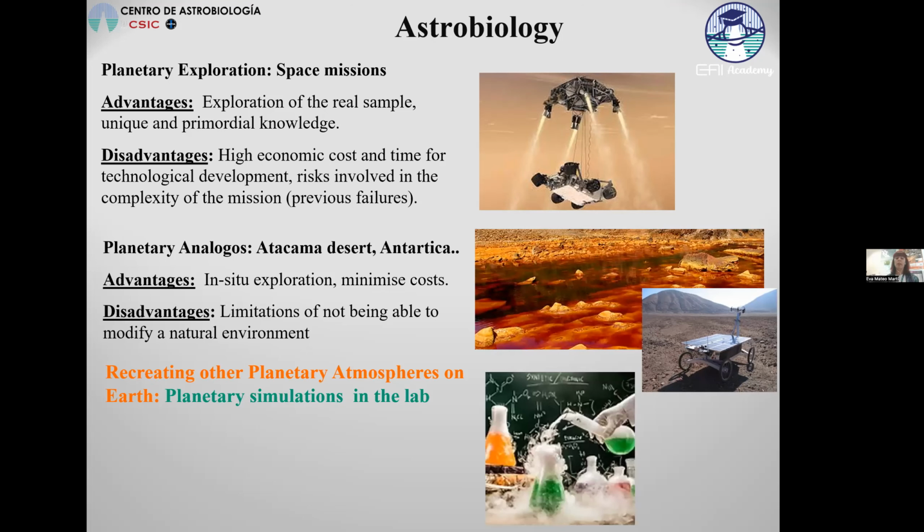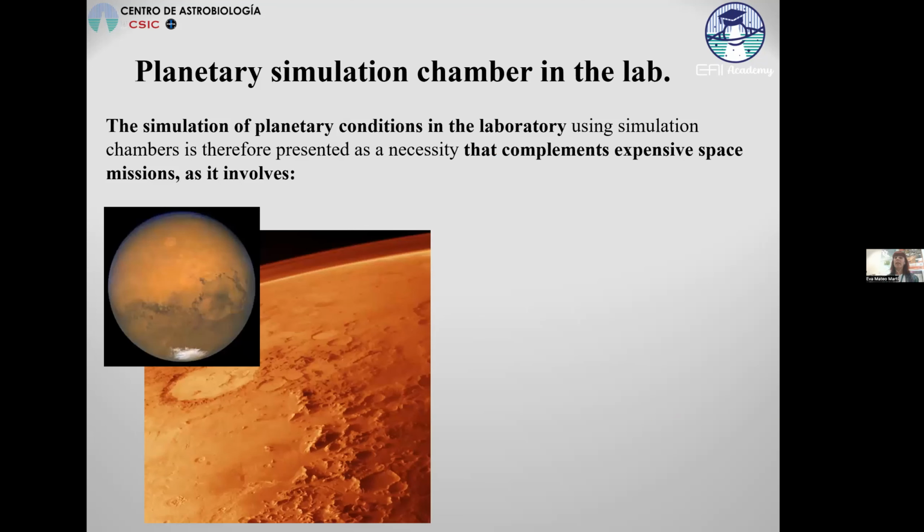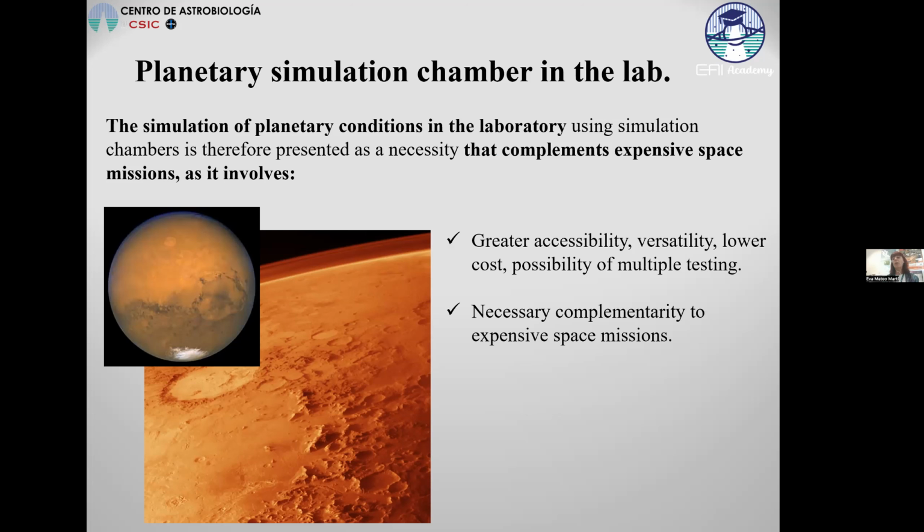So furthermore, we can try to bring those planetary objects to the lab, to put the physical and chemical conditions inside of a container. And that is the thing that I'm going to explain today. Planetary simulation chambers can be a very good complement of the expensive space missions. They involve lower cost, the possibility of multiple testing, versatility and great accessibility.